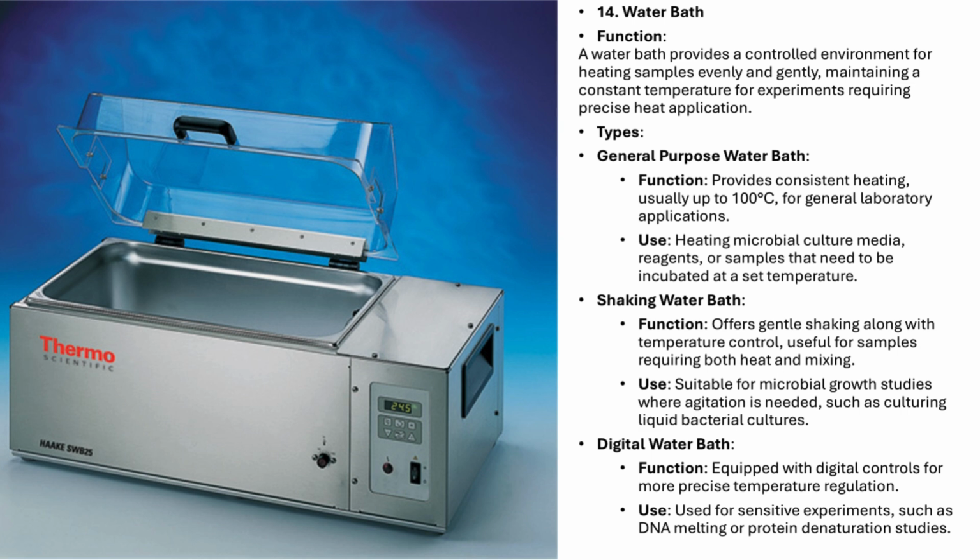This type of water bath offers temperature control along with shaking, which is useful for experiments requiring both heating and mixing. It's commonly used in microbial growth studies, such as culturing liquid bacterial cultures where agitation is needed.